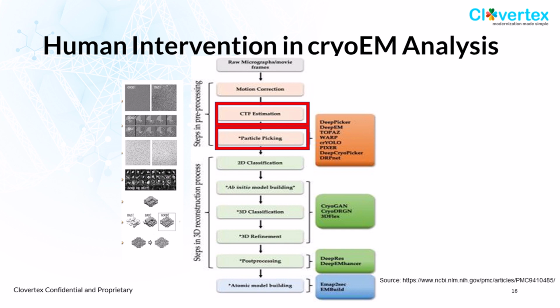These are powerful enough that we can generalize the neural network model, and at this point almost no human intervention is involved for picking the particles. Only if the data set is not so unique. Sometimes you need human intervention, but most of the time, I'd say 80% to 90%, you don't need to do anything to pick the particles.